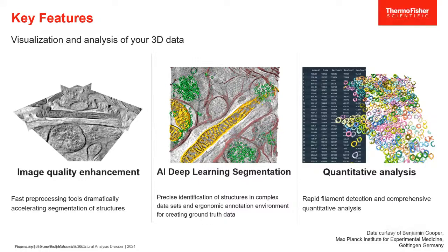And just to add to what Tianbo said, like most traditional deep learning training, our program has a ratio where it initially splits the annotated data you provide into two data sets, the validation set and the training data set. So you'll be seeing a score as the model is being trained, and the validation data set will never have been seen by that model. So you'll be seeing just how well it's going to do with data that it's never been exposed to. So that's another way that you might consider validation.